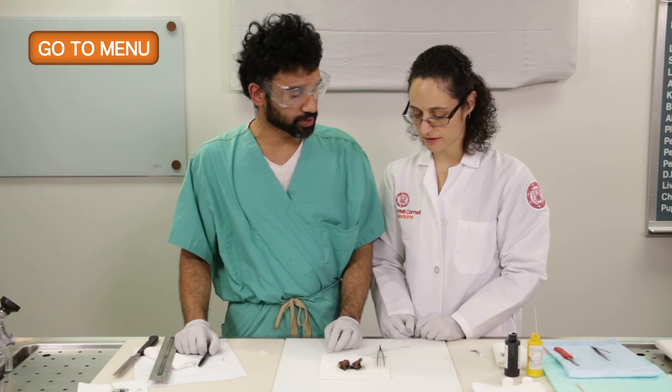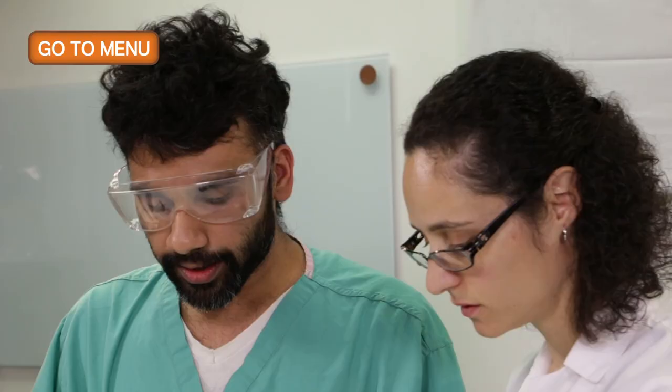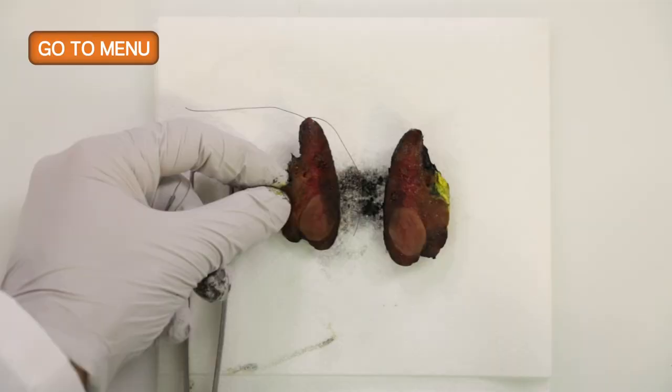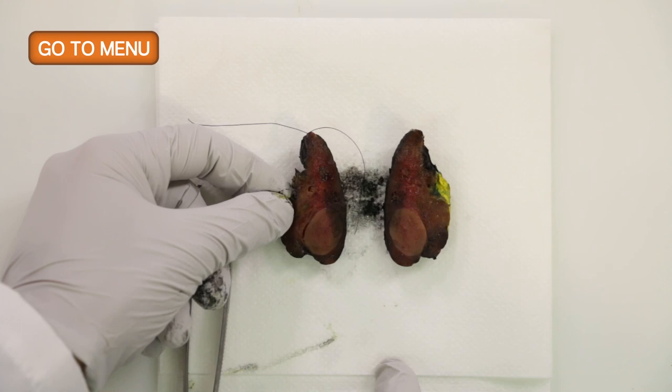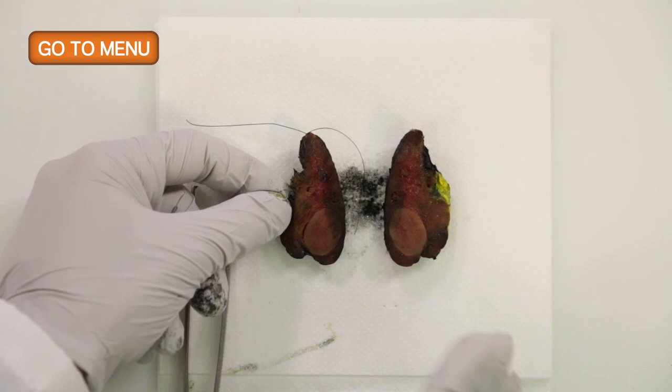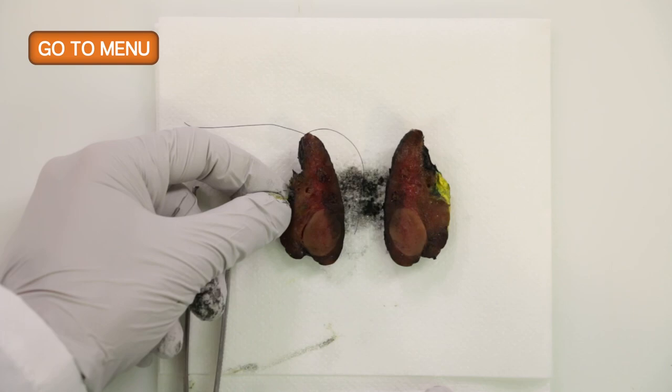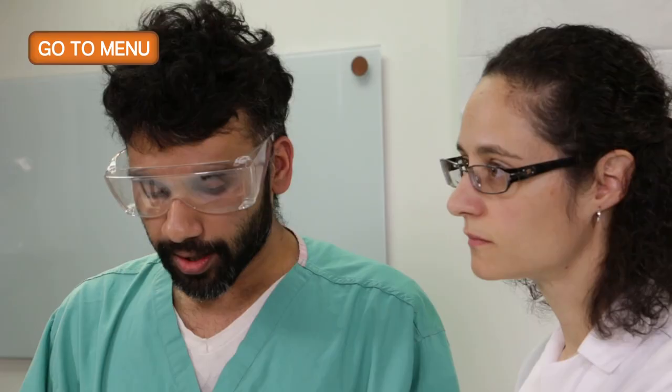Right. And then the next thing is you want to describe what the lesion looks like. So you mentioned it's well circumscribed, which it is, because you can see that it has a really nice border around it, but it's not encapsulated, because like you said, it would be very obvious if there was a fibrous capsule. To me, the lesion looks pretty homogeneous. It has sort of a brown tan appearance to it. And I think that's what I can tell at this point.